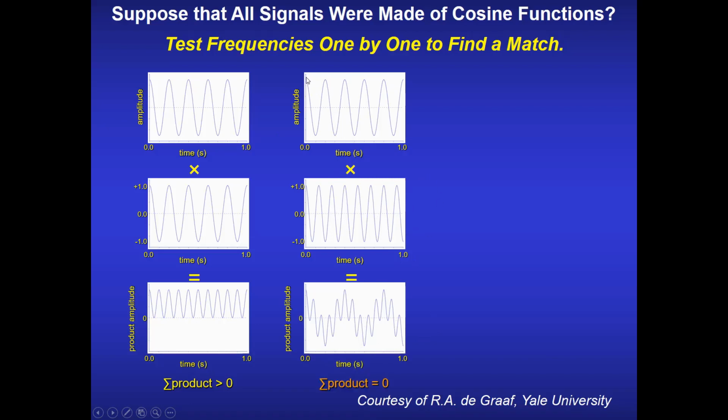Here we have our initial signal, and there's a test. Well, they both match. That's 1, so that's fine. Now we go down here. This is our negative amplitude signal. If we trace this down here, it's also negative, but they don't match at the bottom. It's somewhere here, and in between we have other signals. So if you end up multiplying each point by point with this, sometimes the product is positive, sometimes the product is negative, and if you carry this out to infinity, you get 0 for the sum of all of those test points.